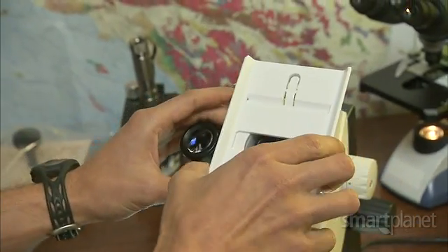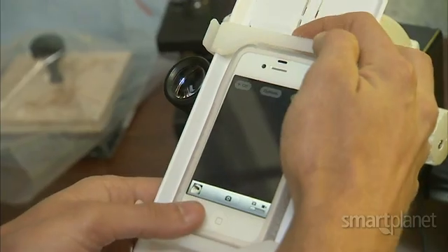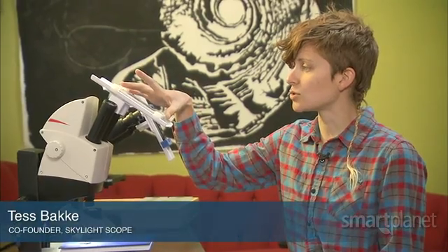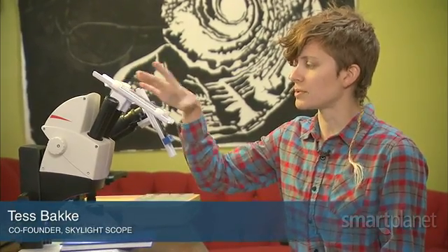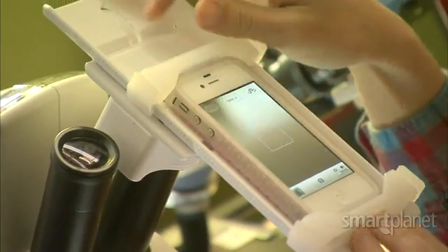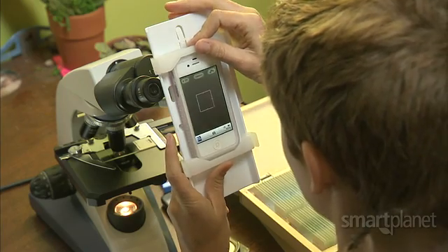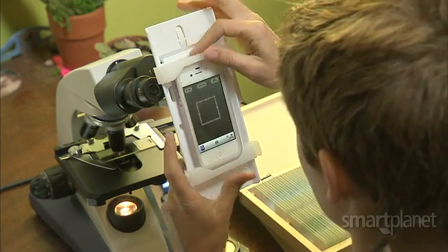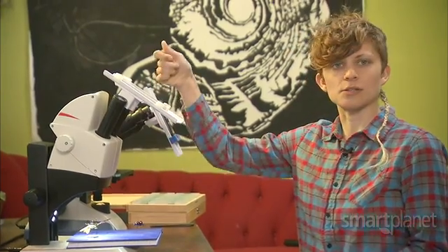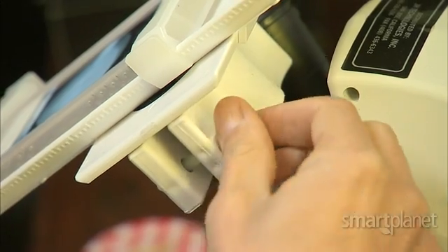Just attach the base to the microscope and slide in the phone. It's sized to hold basically any cell phone. These clips allow it to move in the X and Y direction, and then in the Z direction you can move it up and down with the C-clamp.